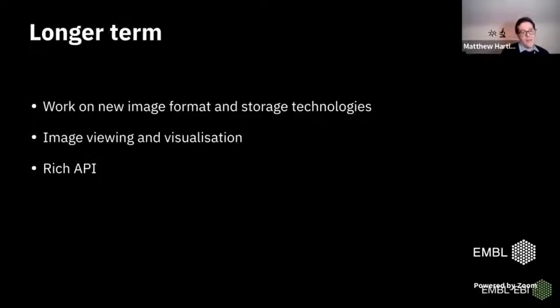Looking a little bit further ahead, there's lots of really exciting work going on about new data formats for imaging data, particularly for very large images and images where you need to access parts of an image.